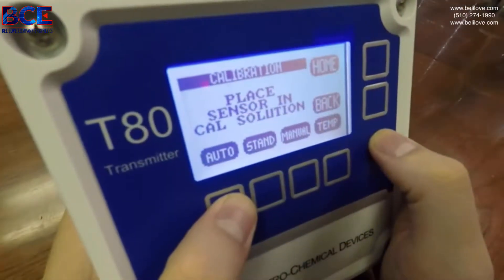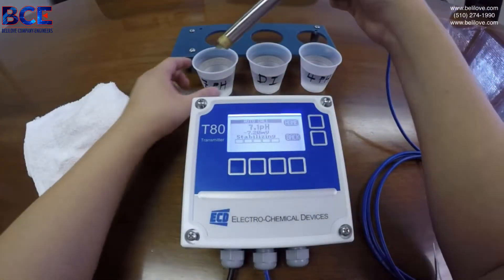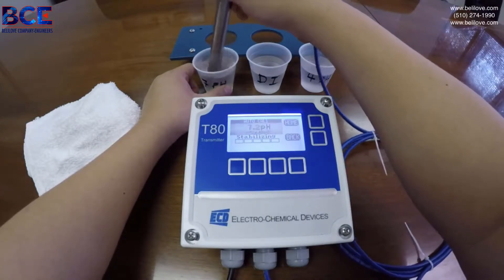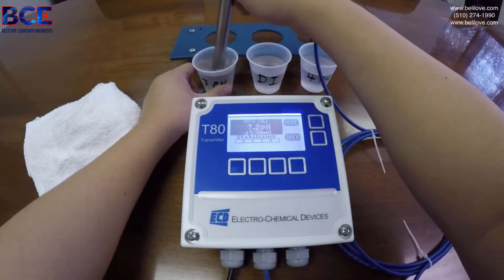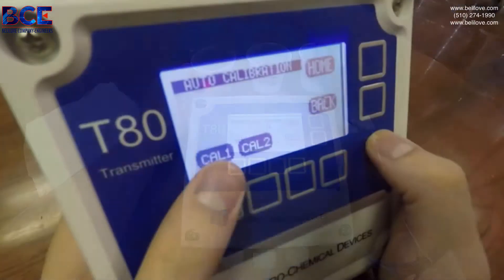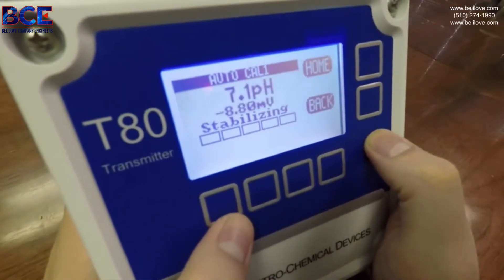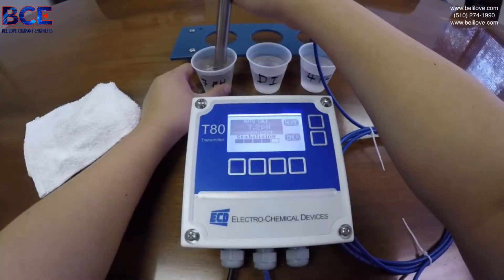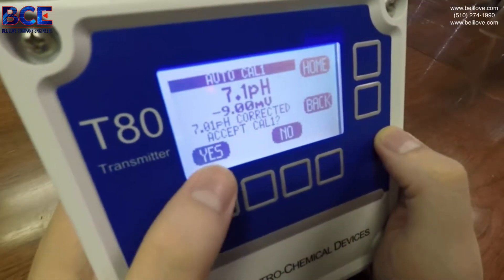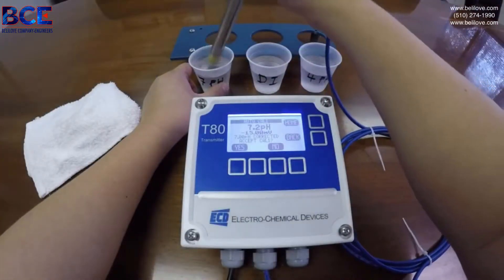We will click auto, cal 1, and you will enter into your 7 pH buffer. Swirl around in your solution — this will represent flow in your process. Wait for the T80 to stabilize, then accept the cal.